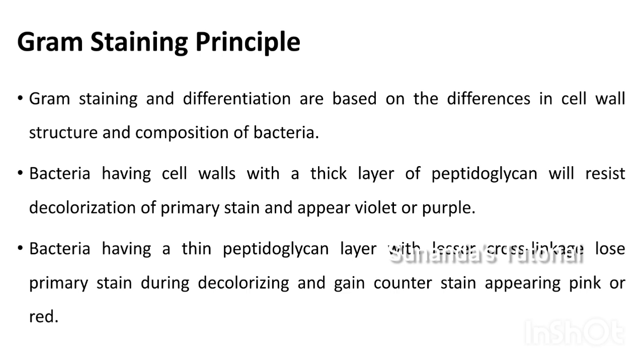Gram staining and differentiation are based on the differences in the cell wall structure and composition of these two groups of bacteria.